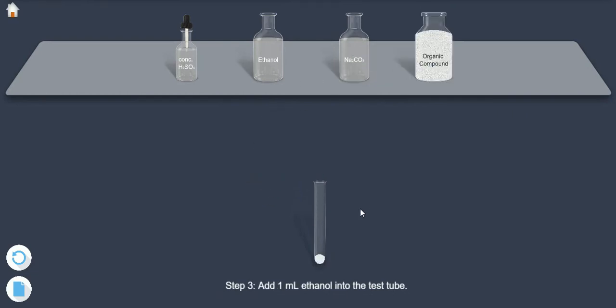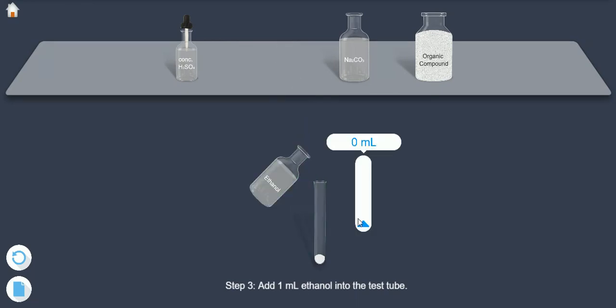Step 3: Add 1 ml of ethanol into the test tube.